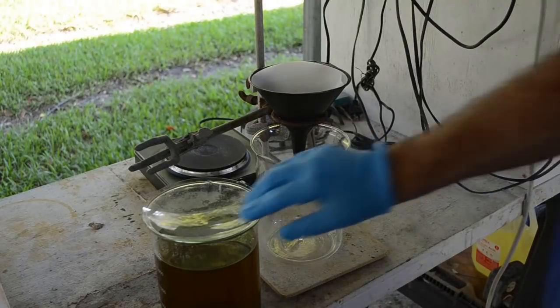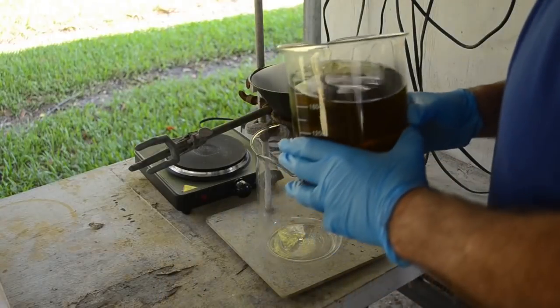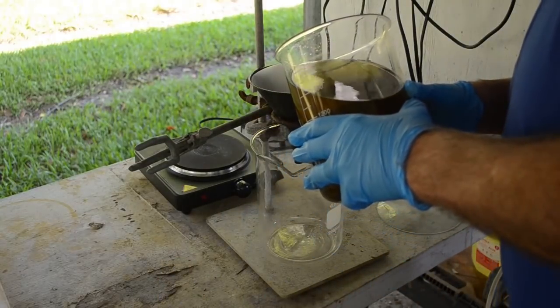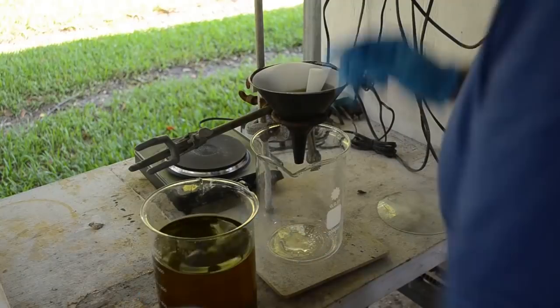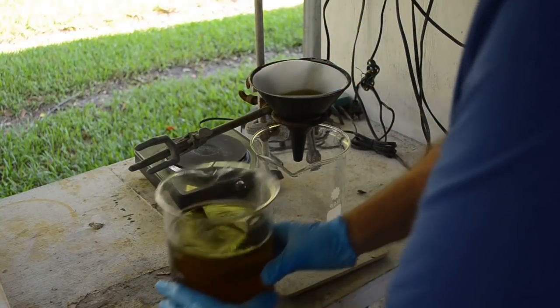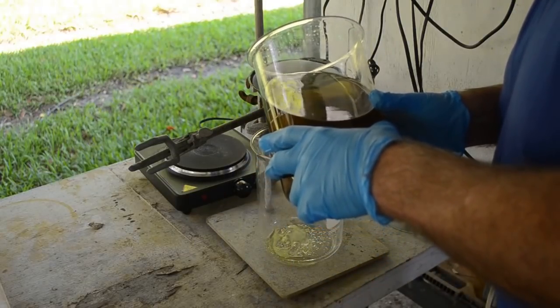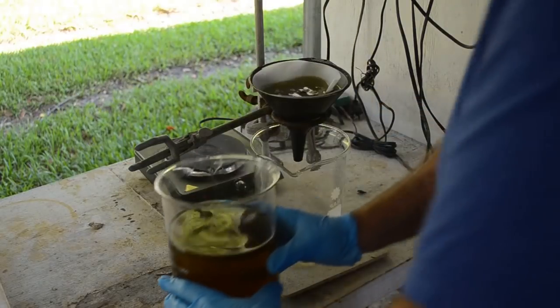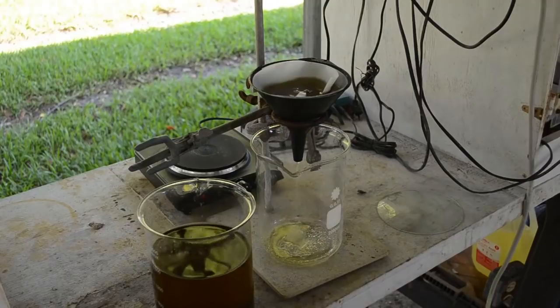Okay, so I'm just going to gravity filter this stuff this morning. It's going to take a while, but that's okay. I've got the time. And the power is going to be out to my lab bench here for a while, so I can't run the vacuum pump. So we'll just do an old school gravity filtration and capture all the gold on this filter, and then we'll re-refine it and see if we can get it cleaner.